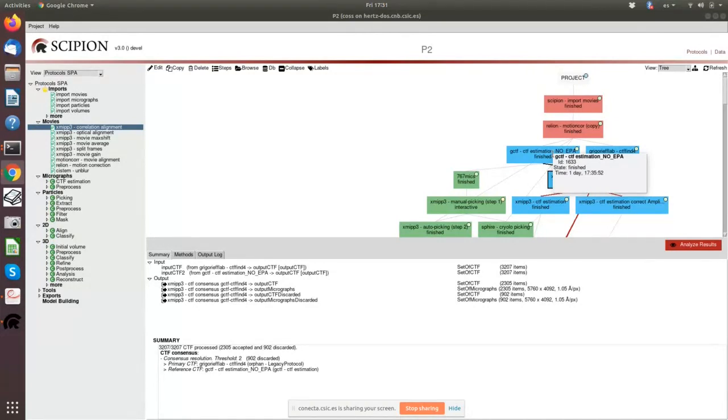One of the programs is saying something, the other program is saying something else. If you look at the power spectra, they more or less look the same. So I cannot decide which one of the two is correct. And then I have to leave these micrographs apart because I cannot determine the defocus so accurately.